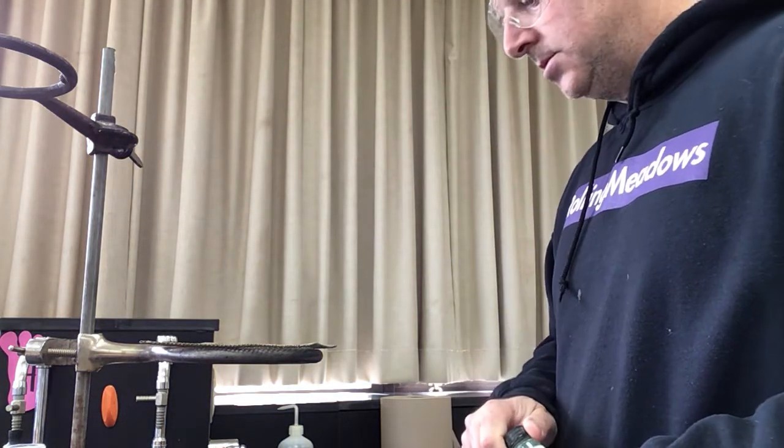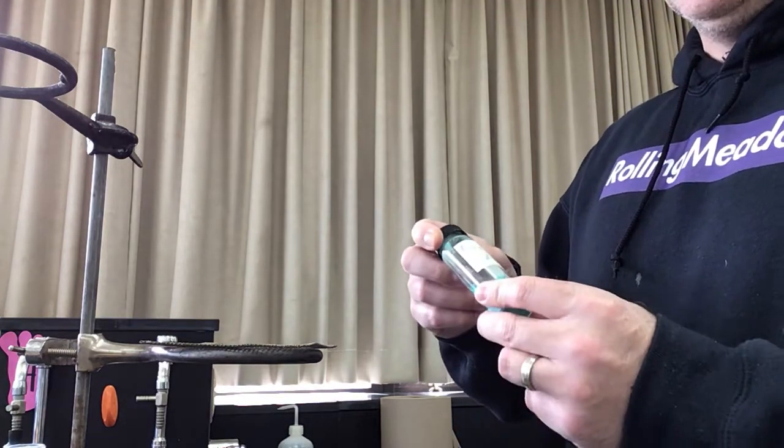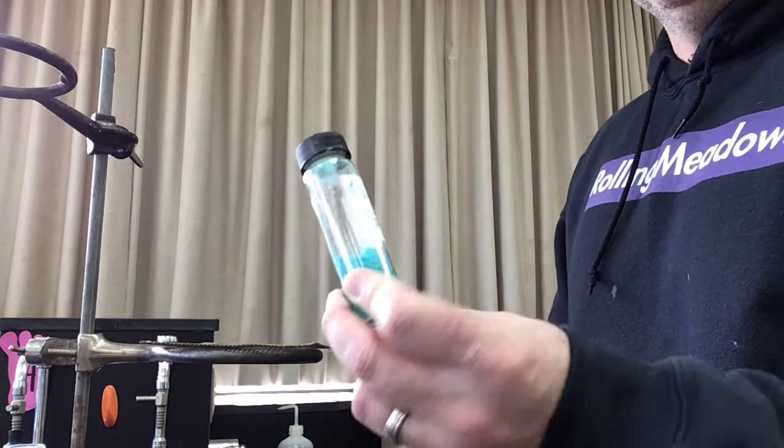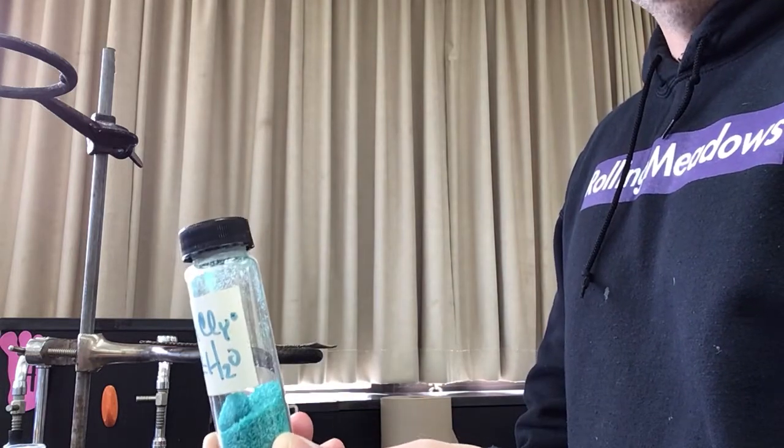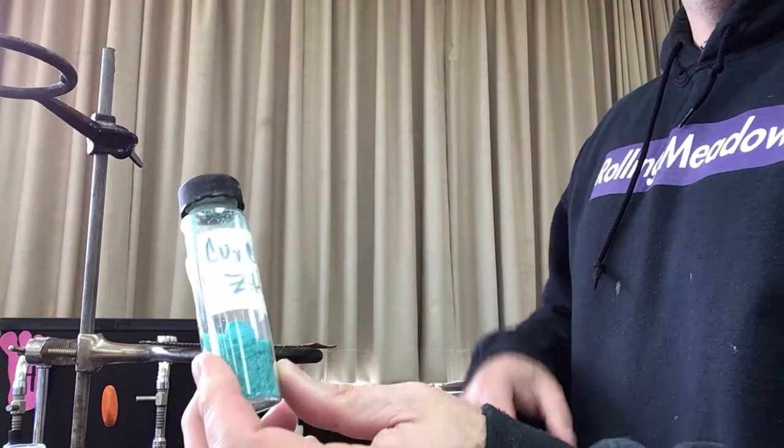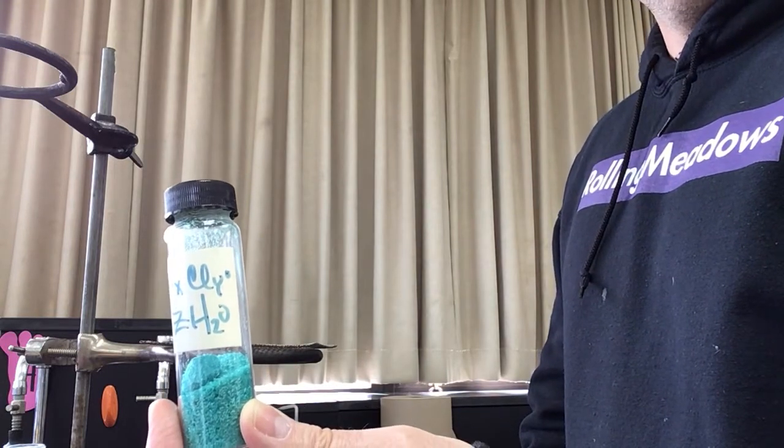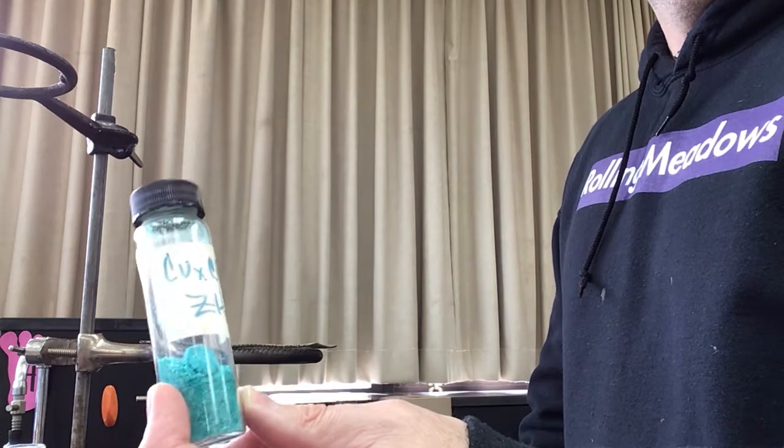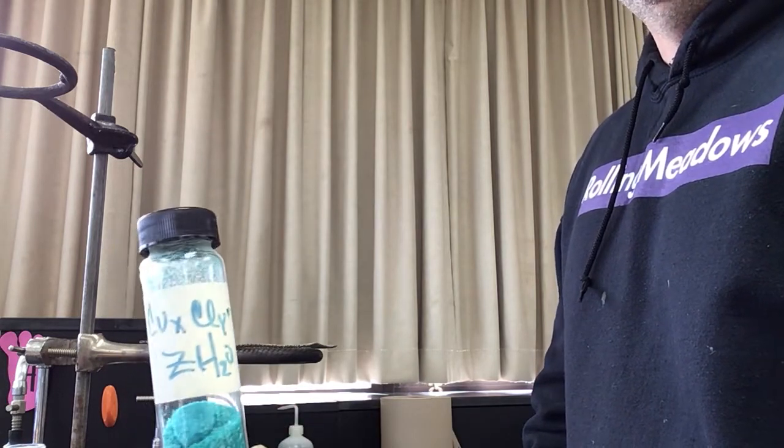Hey everybody, what we're going to do today is go over experiment four where we determine the empirical formula of a hydrate. We've got a copper chloride hydrate, and you can see on the bottle it says CuX, CLY, and then H2O with Z in front. Those X, Y, and Z are variables that we're going to be able to figure out.